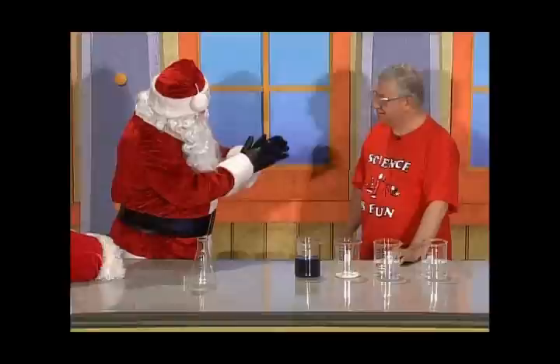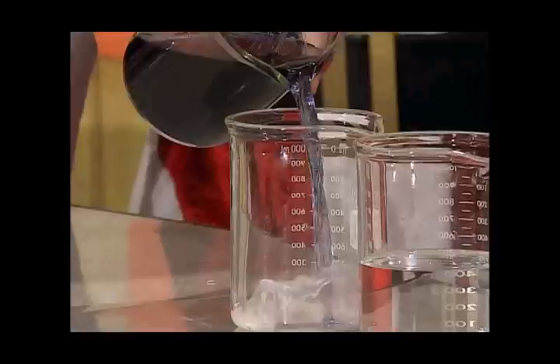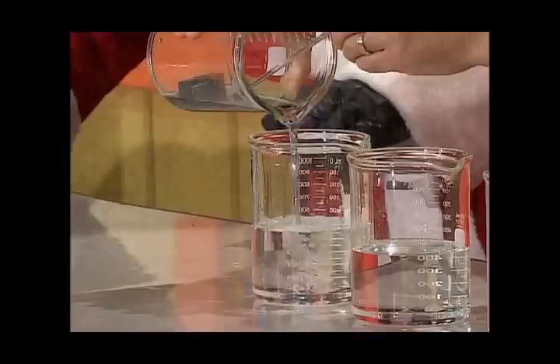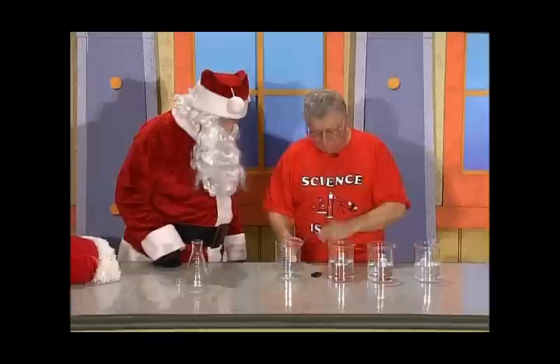But we have a problem. I need the battery back, you know. Oh, you want the battery back. I want my battery back. Of course. No problem. Here, I'll pour the blue liquid into this beaker here. Wait a minute. What? It was blue. Now it's colorless. Yes. Well, and clear. But you want the battery back, right? That's what's important to you, right? Yep. It's important to me, too. So here's your battery back. But you know what? The blue is there. I don't believe it. The blue's hiding? It's hiding in there.